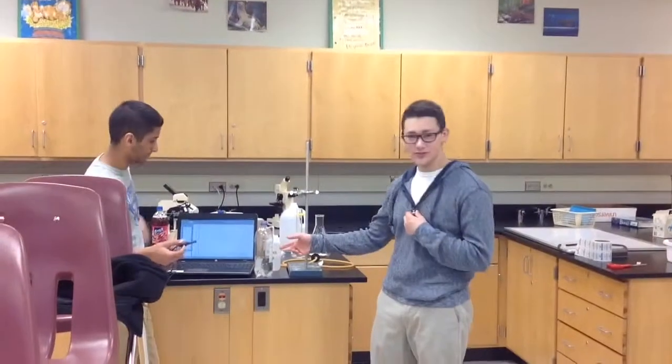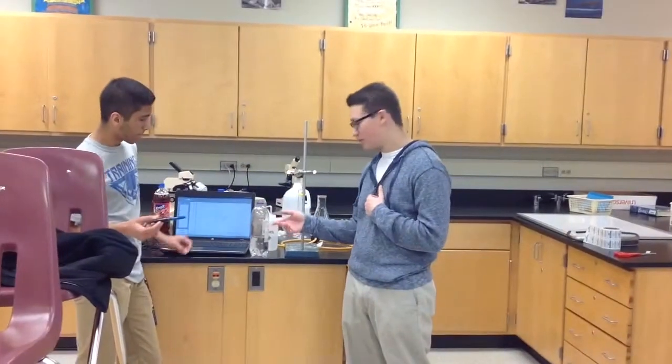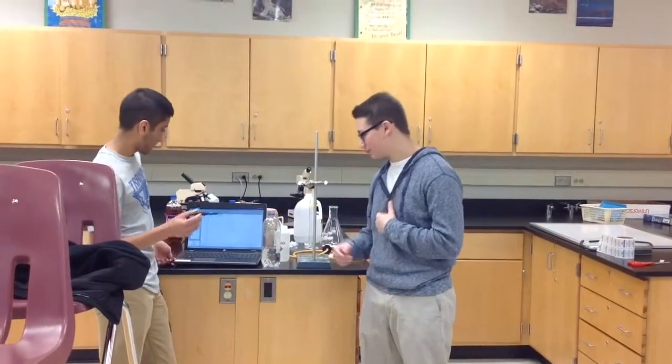We now have the 400 milliliters of distilled water in the 1 liter cup, and Arhan will now be testing the pH of the distilled water with the pH meter.